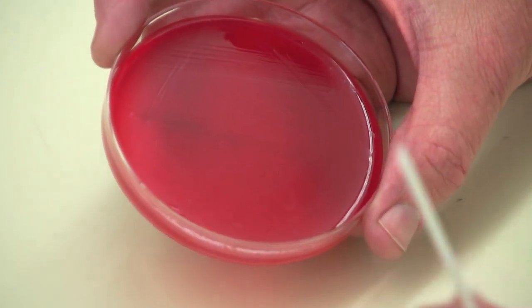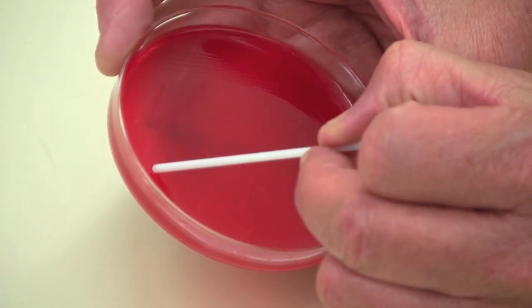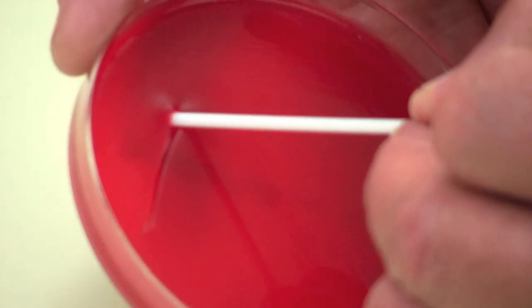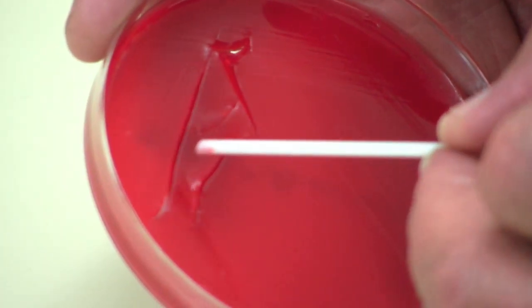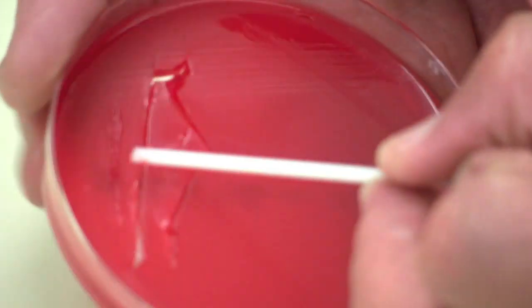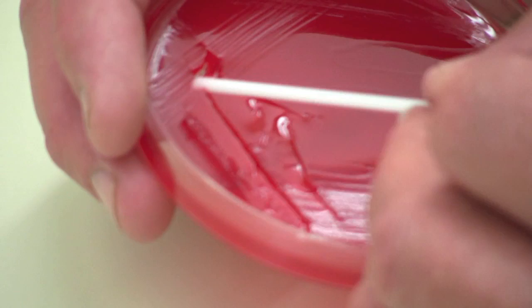Now this is just the end of a swab, but I'm going to show you how you can dig into this agar easily. So just be careful when you're streaking to not use hardly any pressure - just lightly go across the surface of the plate.